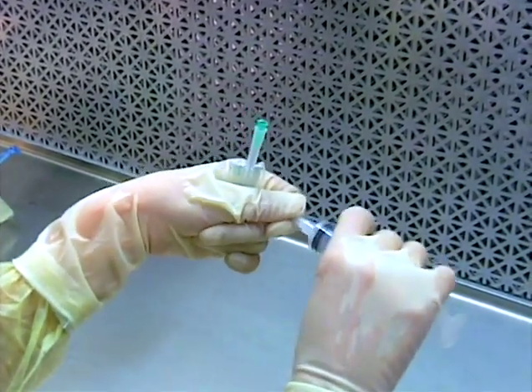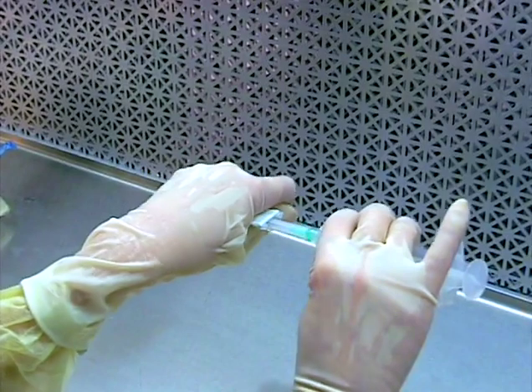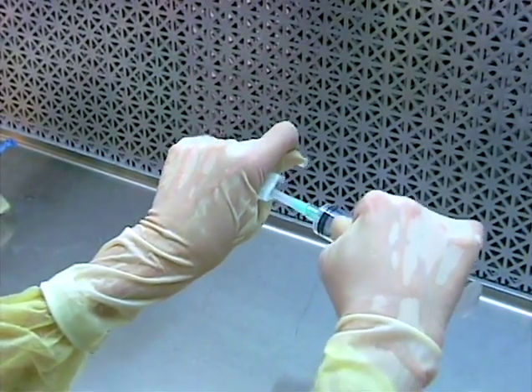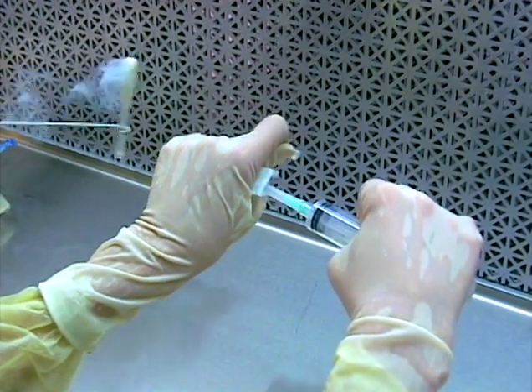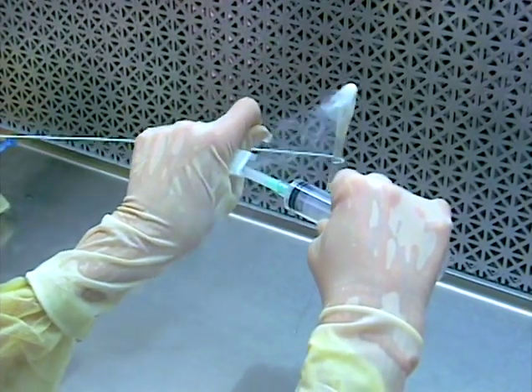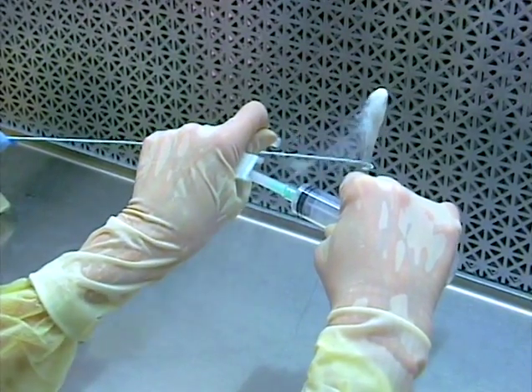Using the thumb and forefinger of the needle hand, twist the cap off the syringe. Bring the needle and the syringe together in first air and secure the needle to the syringe by twisting gently to activate the lock. Do not block the flow of first air to any critical site during this procedure.